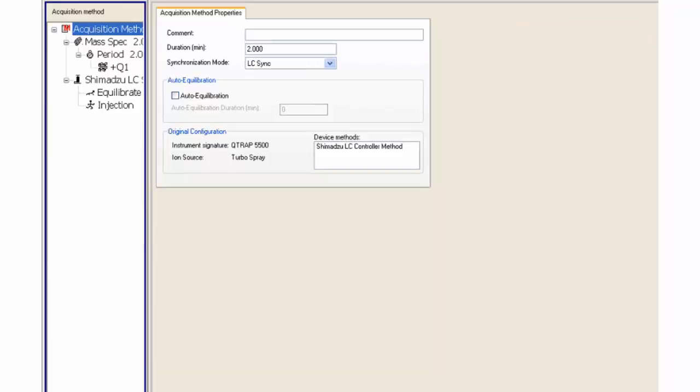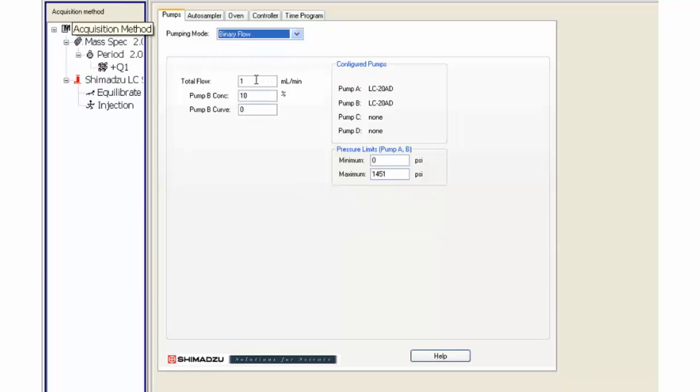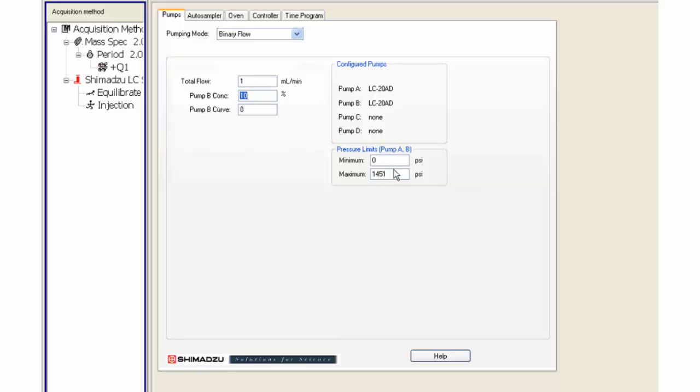Click on the pumps tab. Choose the pump mode if available. Binary mode is more common and will be used. Add the total flow and the initial pump B concentration. If the pressure is expected to go above the default maximum limit then change it.